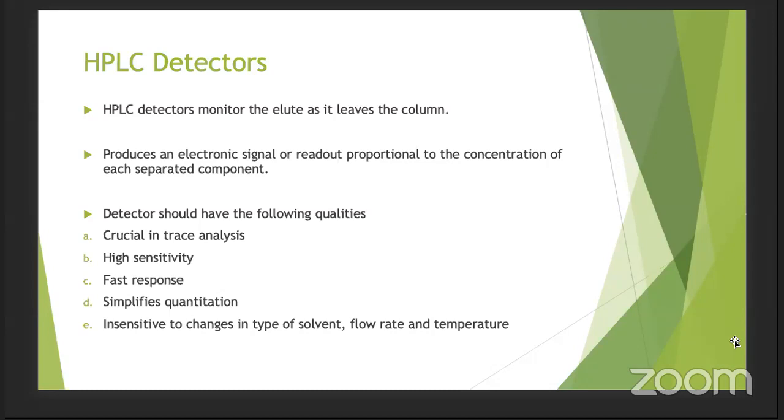And these detectors should have the following qualities: it should be capable of crucial trace analysis. Then it should have high sensitivity. It should be fast to respond. It simplifies quantitation. Then it should be insensitive to change. It should be insensitive to any change in the solvent, the flow rate, or the temperature.